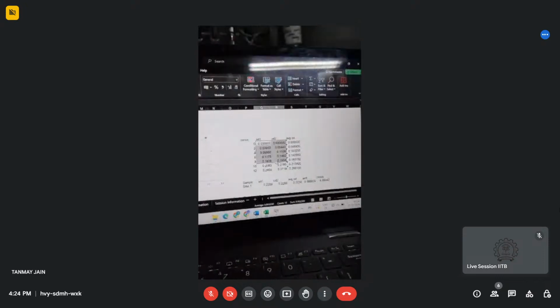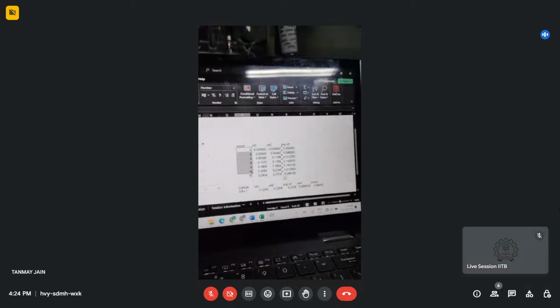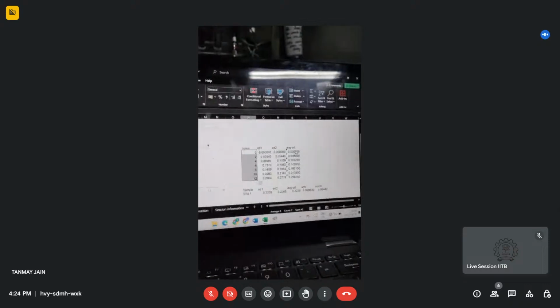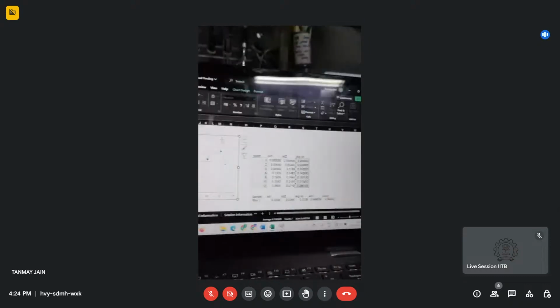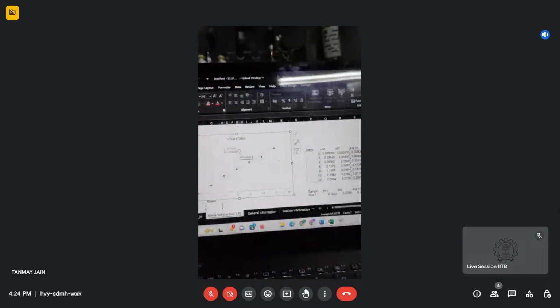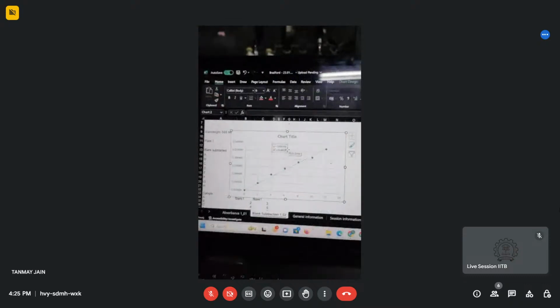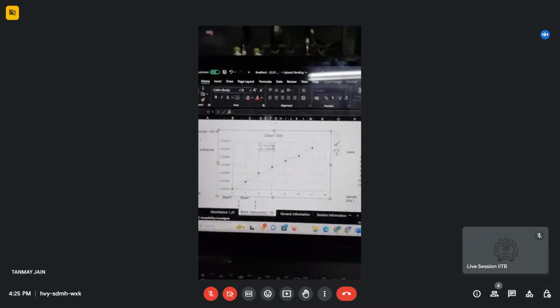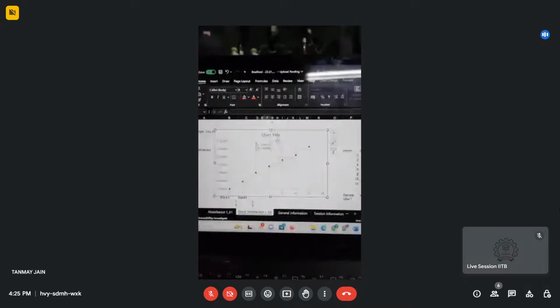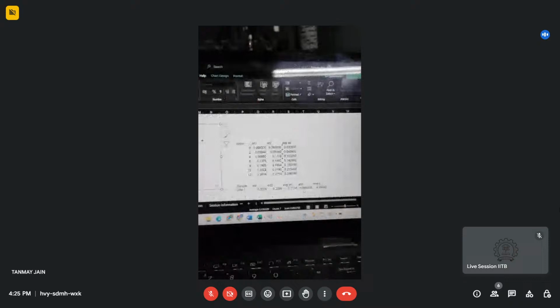as like this. So these are the absorbance values from different concentrations of BSA that we got, and we have done the experiments in replicates. So we have got replicates, you have taken the average value, and we plot the average absorbance value, and you get the standard curve. So a standard curve, you will get something like that, where you must have an R square value greater than 0.9. And from that particular equation, you will be able to estimate the concentration of an unknown protein sample.